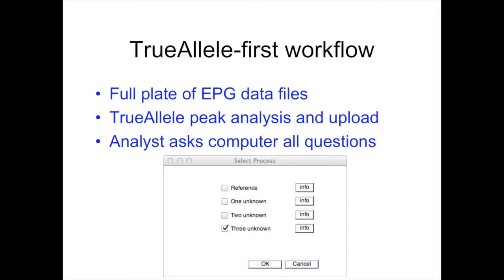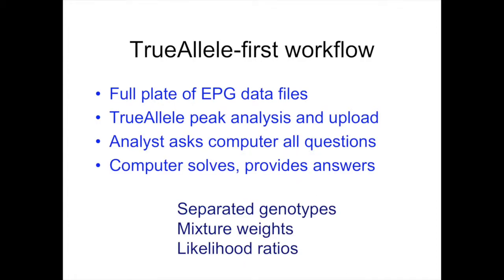And the same thing if there's 4 or 5. You're still going to be getting the genotypes there that are going to be giving you the information. Those very low-level 4 and 5 person minors, chances are you may not pull those out in a very quick screening, but then you could have a look at them later on if you needed to look more in-depth at them. So the computer solved all of those genotypes for you.